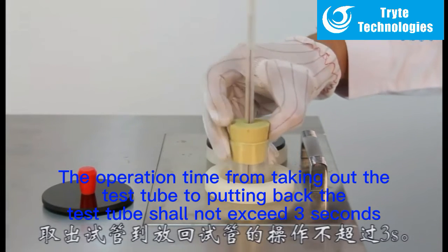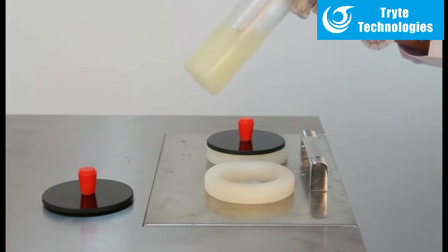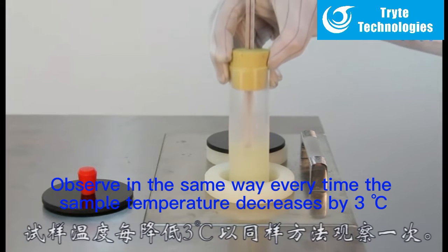The operation time from taking out the test tube to putting back the test tube shall not exceed 3 seconds. Observe in the same way every time the sample temperature decreases by 3 degrees Celsius.